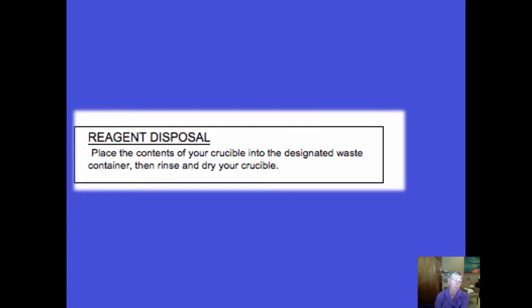Not only does it have to be clean, it has to be dry, and it needs to personally be returned to the teacher in a clean and dry state. You will not just return it to the supply tub. It needs to be inspected by the instructor.